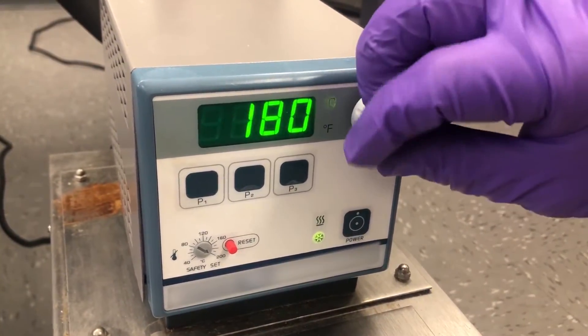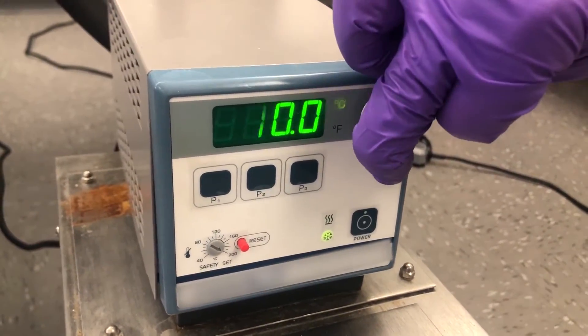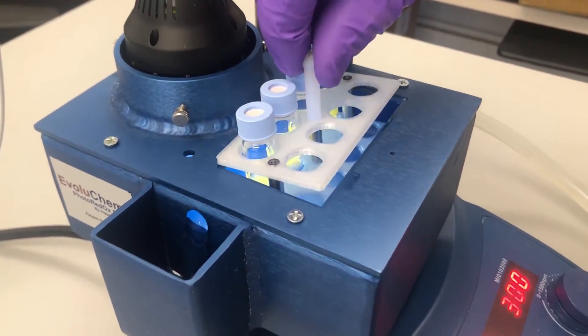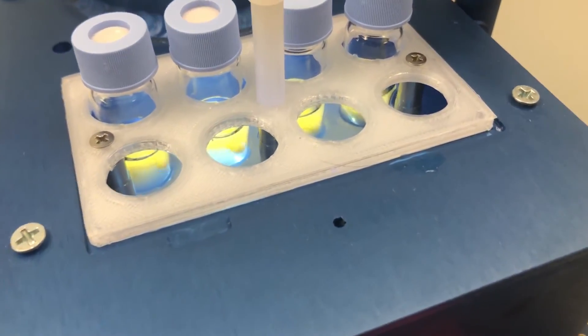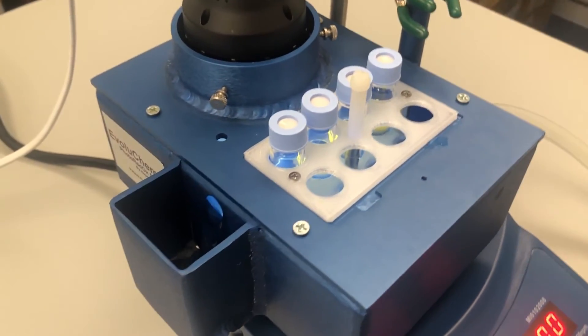With the flow rate set, the chiller can now be adjusted to the appropriate temperature for your experiments. Now you can place your reaction vials into the reaction chamber with one of our multiple format vial holders and conduct your reactions. You'll notice that the vials are being engaged by the stirring plate and there is a steady flow of temperature-controlled fluid through the photoreactor.